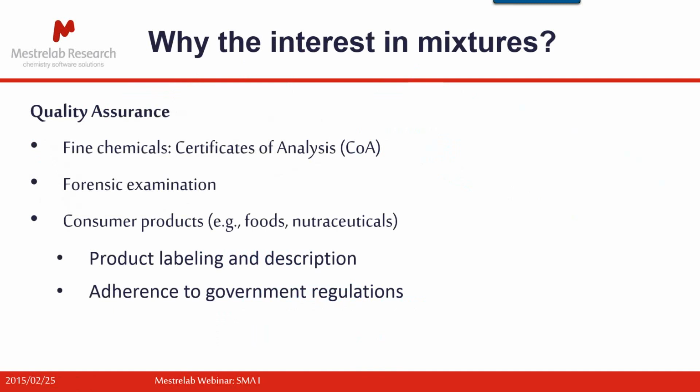Forensic examination is a huge area which is very, very tightly regulated, as you'd imagine, and they make very strong use of purity determination and such like. This is obviously for use in the courts. Consumer products, foods, nutraceuticals, wines, beers, anything you'd like to put here. These are all coming under far greater scrutiny than has ever been the case in the past. People traditionally have just put anything in a bag and put a name on it and said what's in there.